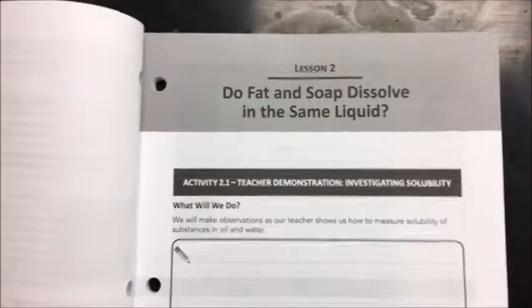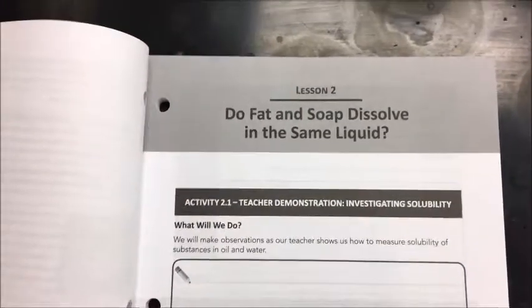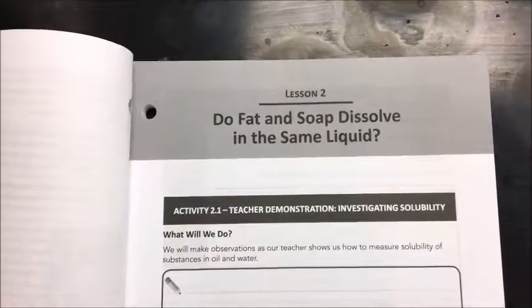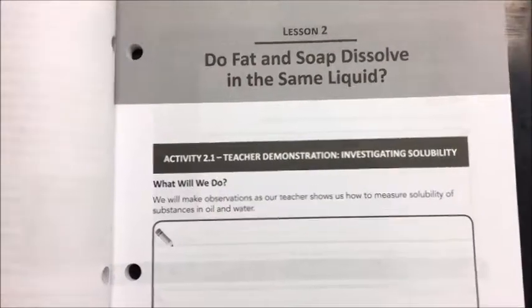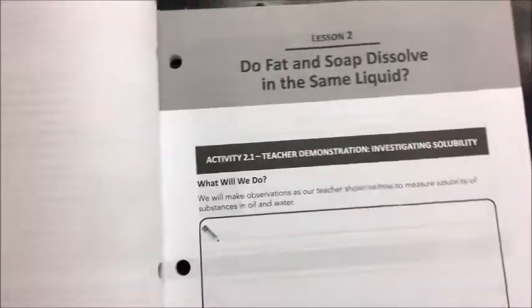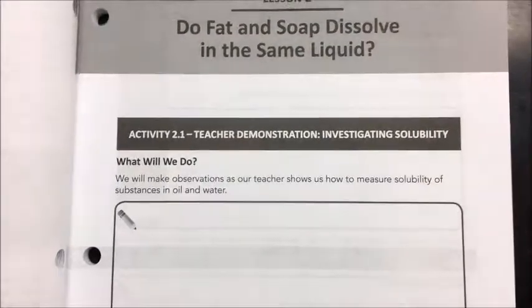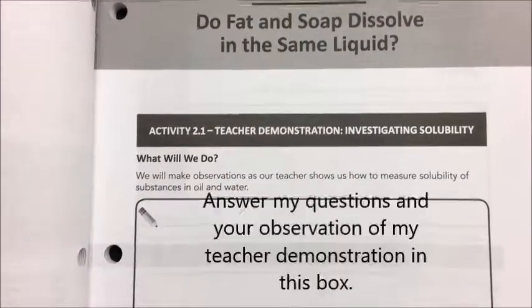Okay, class. Today we're going to be looking at lesson 2 in our workbooks. And the question this time around is, do fat and soap dissolve in the same liquid? So this is 2.1. I'm going to do a teacher demonstration investigating solubility. And what we're going to do, we will make observations as our teacher shows us how to measure solubility in substances in oil and water.